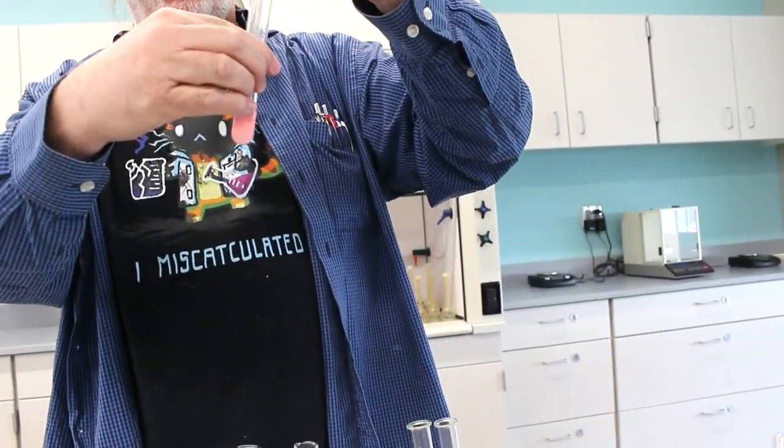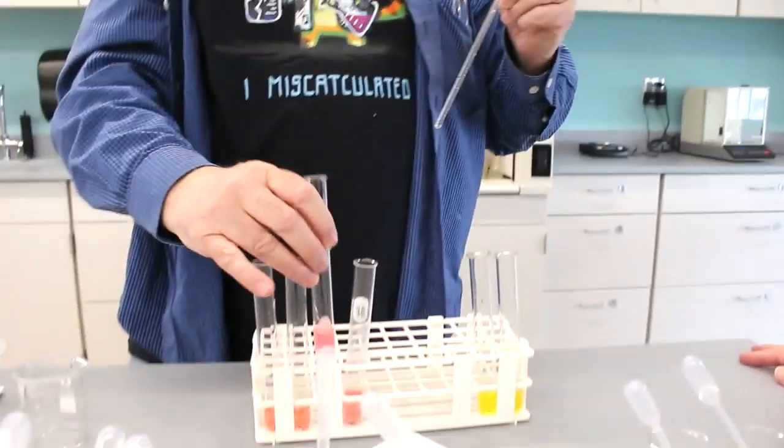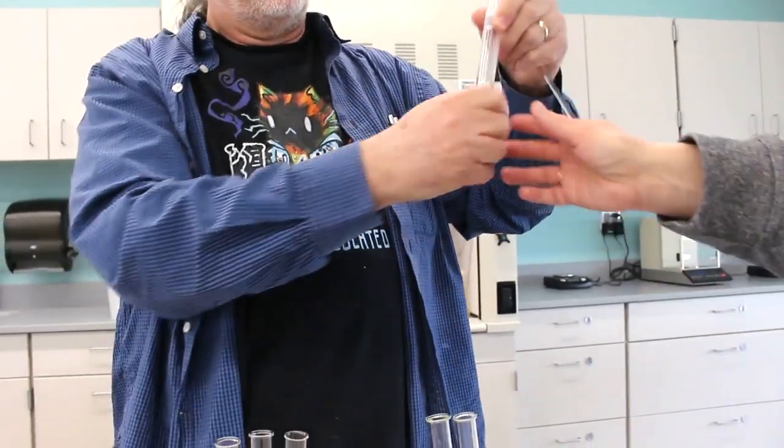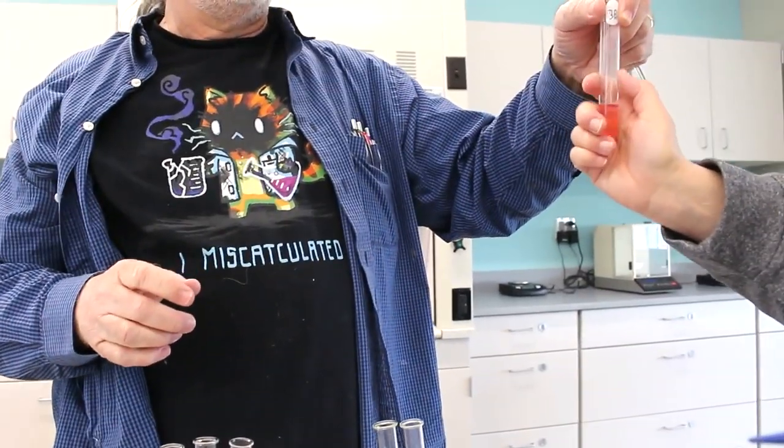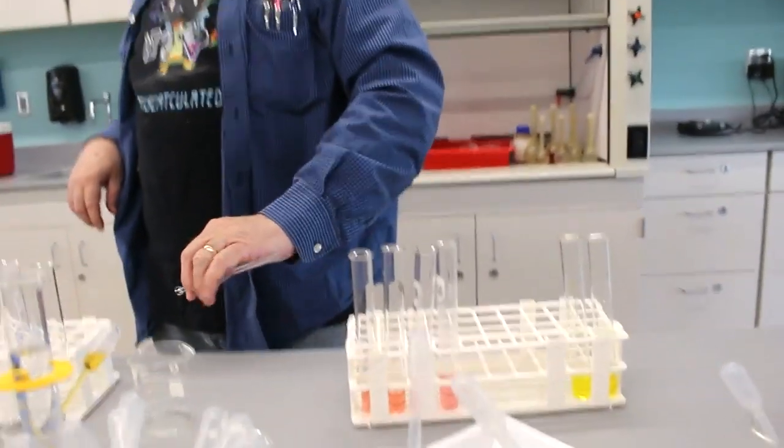Oh yeah, it does. It looks pinker. It looks even more pink. Feel the test tube. Ooh, it's cold. Very endothermic. So we've actually decreased the temperature there a little bit. Let's cool it back down. The HCl one is a little warm, but not too warm. And then to the third one, we're not going to add anything.